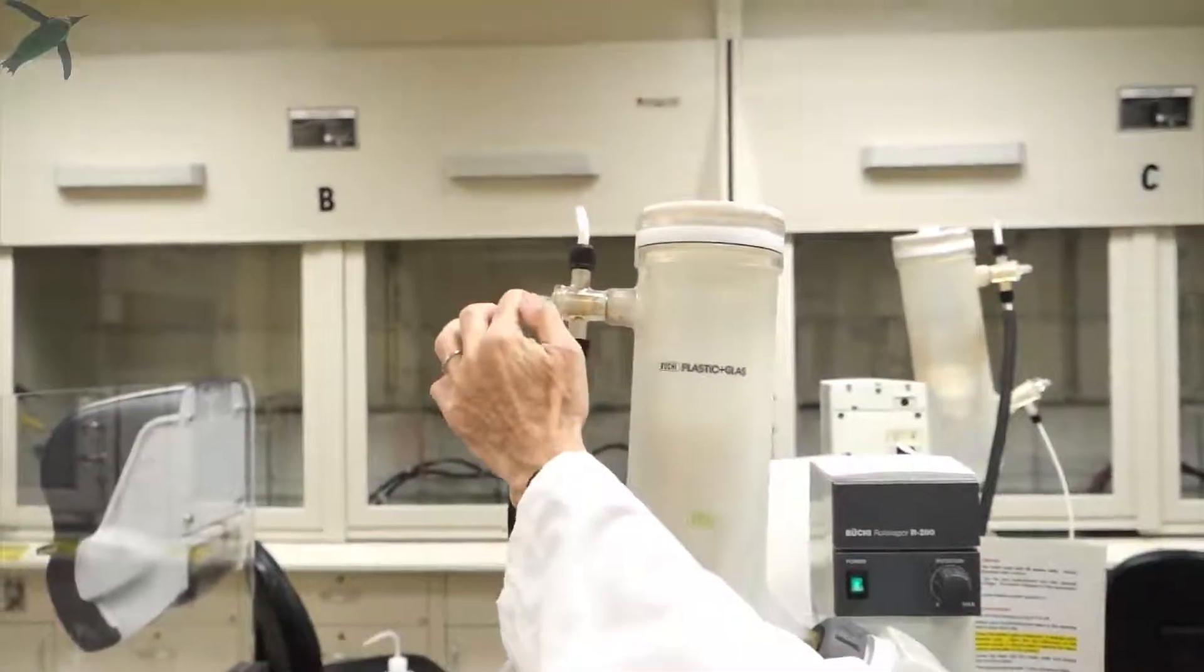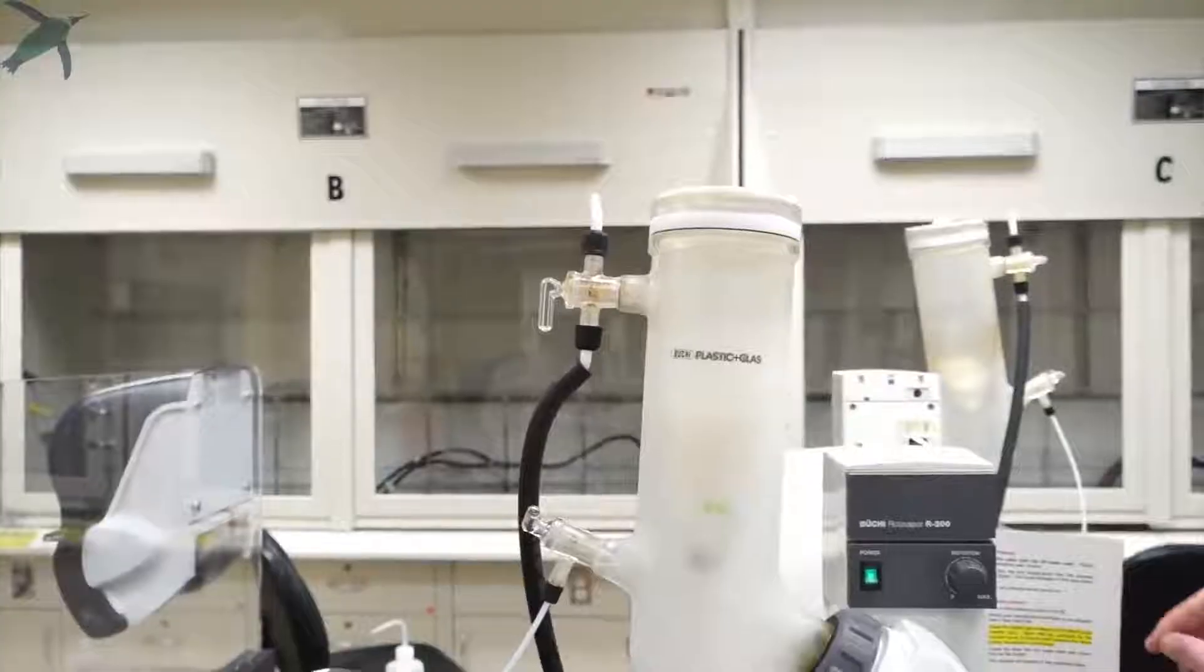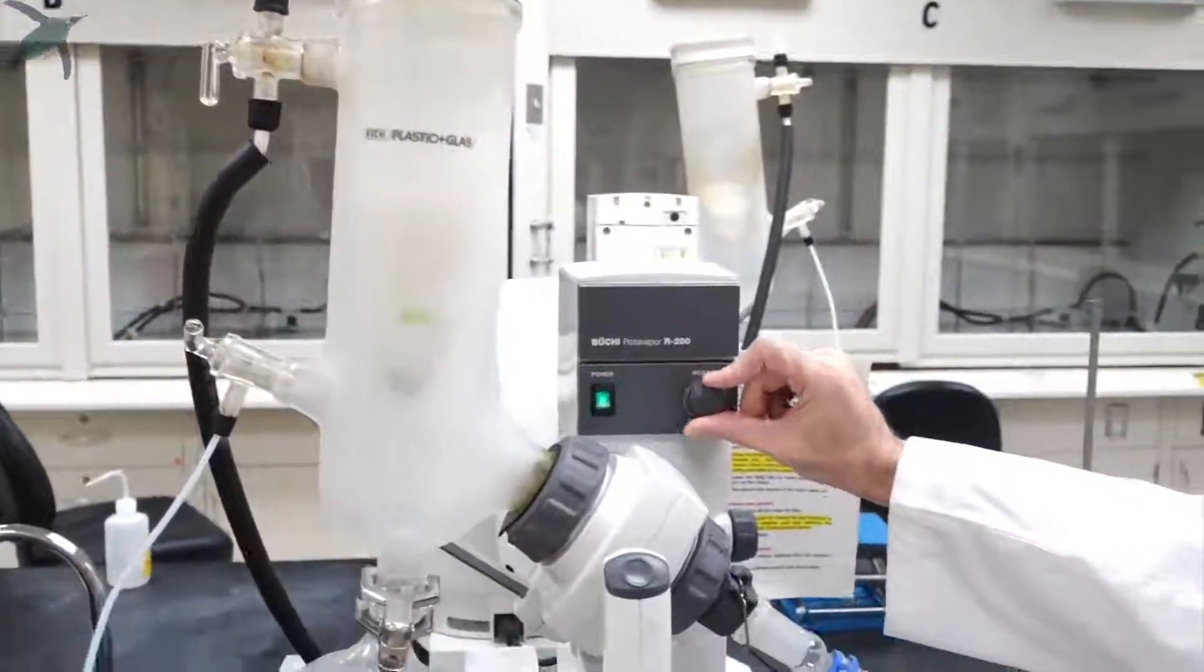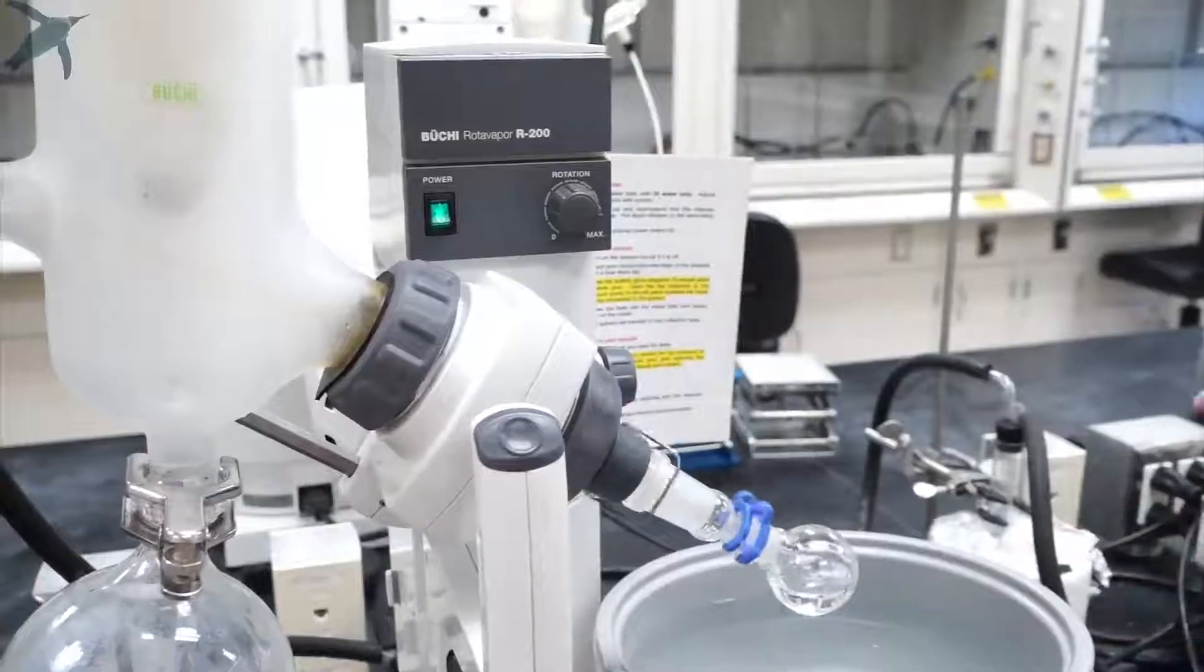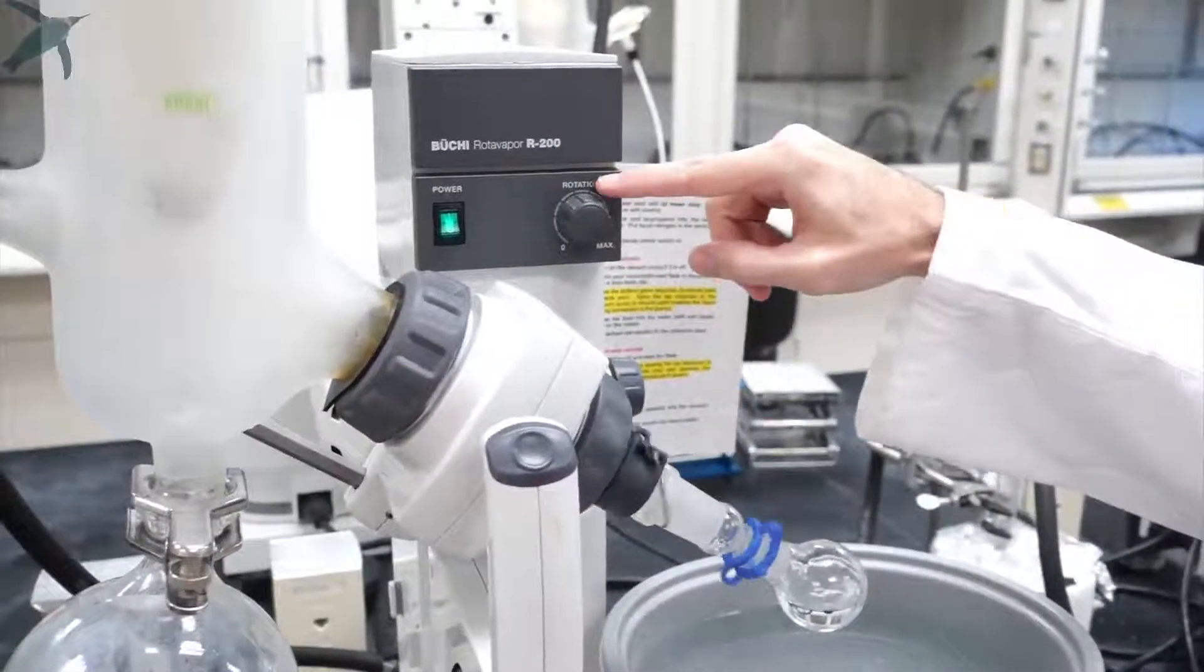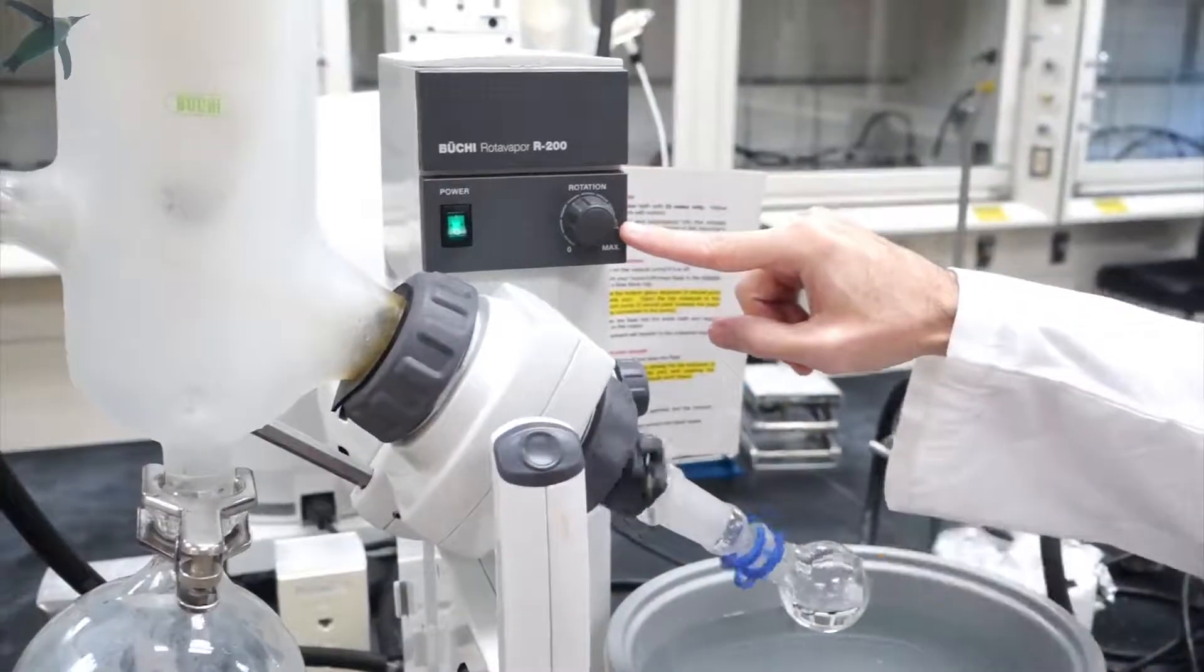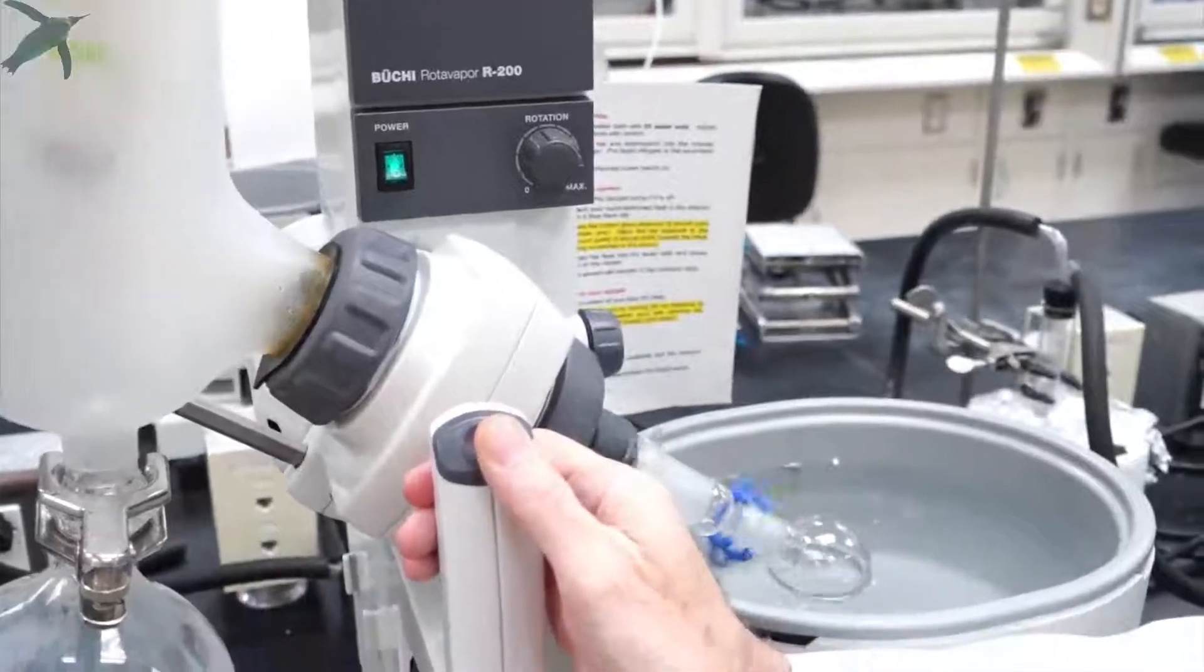Then you connect the system to the vacuum, turning it down pointing towards the vacuum hose. Immediately start the rotation. For a small flask, the rotation can be fairly brisk, half to three quarters of the speed. Then you lower your flask in the water bath.